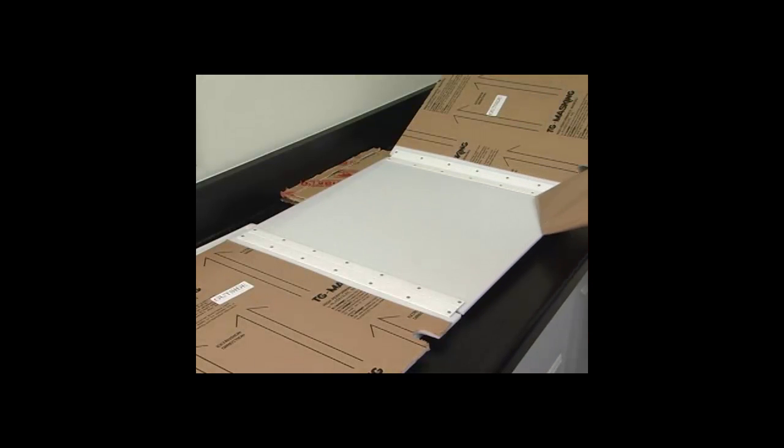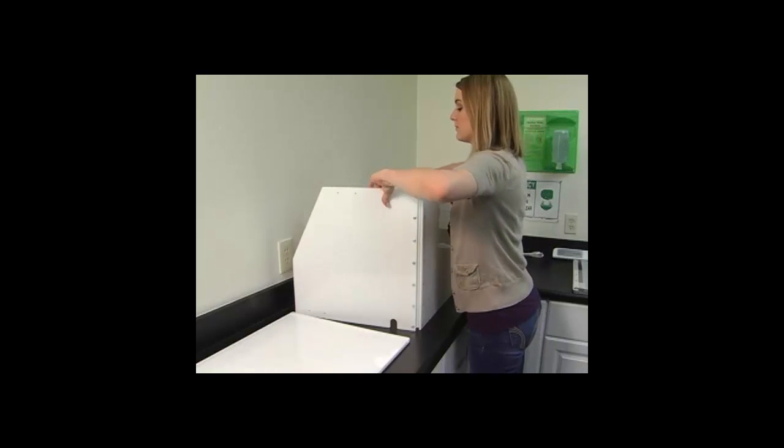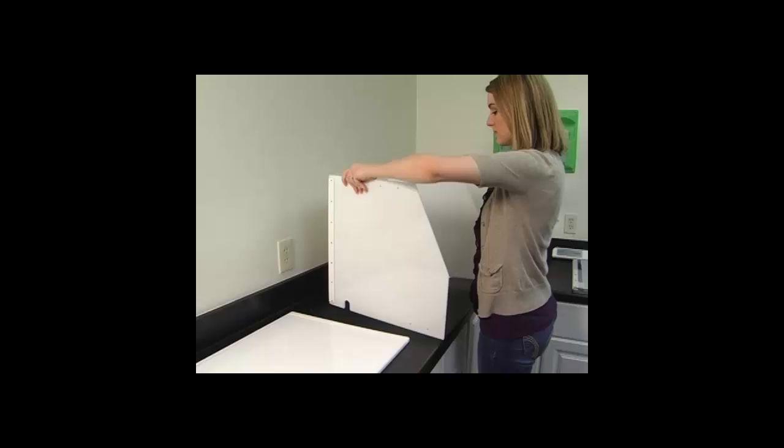Once you have removed all the parts from the packaging, remove all of the brown adhesive covers from the hood's panels. Then place the base of the hood on a solid stationary surface with the groove side up.